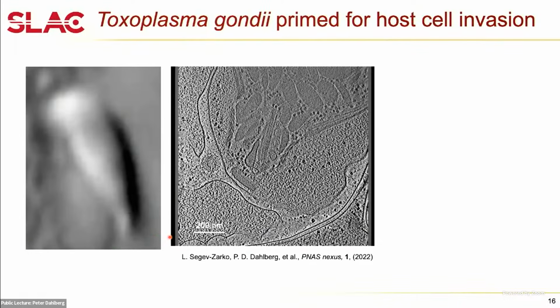And the way that we get these parasites is we've ripped them out of the human cells that they were living in. So in this slice, you can see a lot of cell debris out here. This is sort of cell debris from the human cell that this parasite was in. But then the parasite itself is sort of this structure here. So this right here is the apical complex of Toxoplasma gondii. So again, as I play this video, we're going to go slice by slice and see how these different structures are arranged in three-dimensional space.